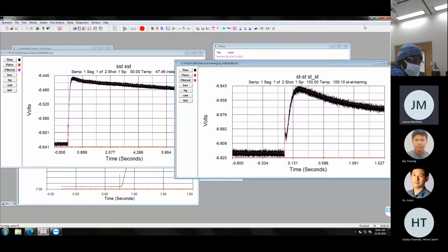If you have a spot on there that's not coated, for example, with the stainless steel, it's a shiny surface, so it would bounce some of that light back, and it would not be absorbed by the sample. So if you see yourself not getting a good shot, it might be because it's not absorbing enough light, or too much light is going around the sample, and you end up with something like you see here, where it's stepped up. The actual rise doesn't happen until after the baseline. It's stepped up a little bit. So just be conscious of that.